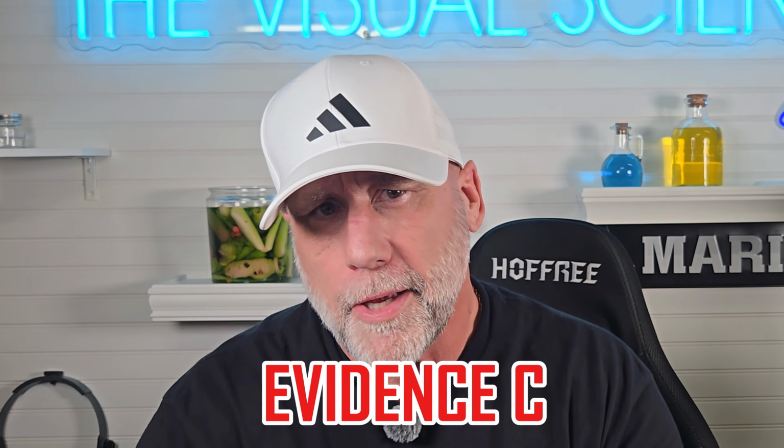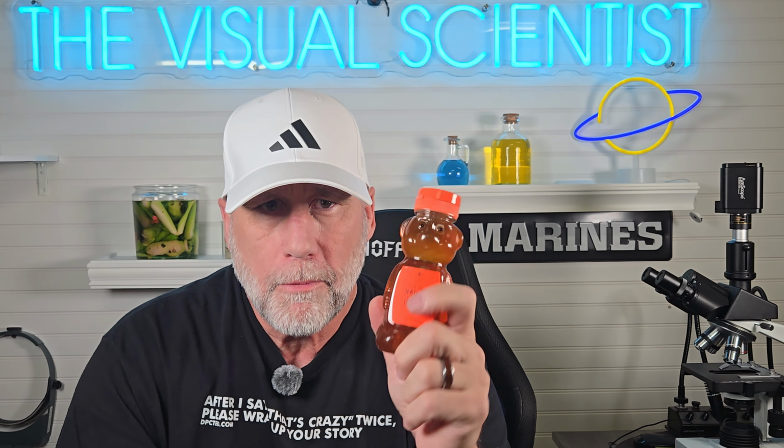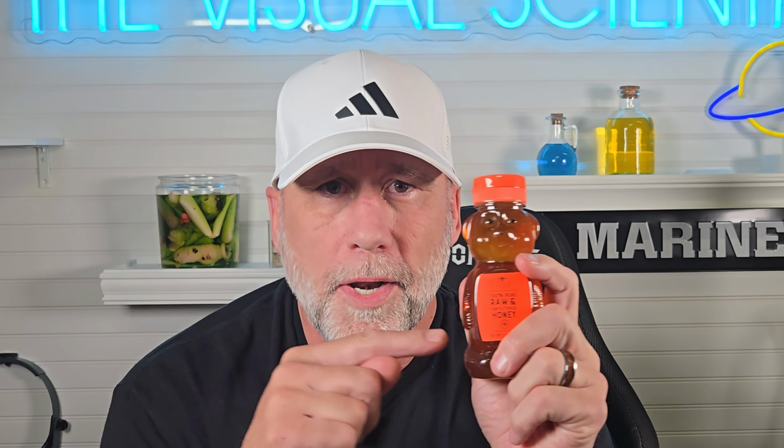Evidence C is Nature Nate's raw and unfiltered honey. I gave this guy a grade A. Go back to that 400 slide. What you were looking at, those irregular structures distributed through the whole sample, pollen, the biological fingerprint. It's there because nobody stripped it out. Irregular crystallization throughout. Dense biological complexity at every magnification. At 1,000 times, the most structurally rich sample I've examined in this category. This is what honey is supposed to look like before industry decided shelf life mattered more than the product.